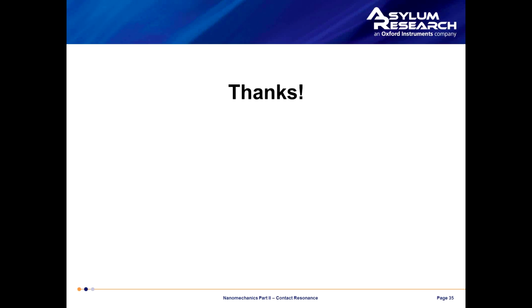All right, thank you. And next, a question for Donna. So back to contact resonance. The question is, this is all carried out in the linear regime, but how does one account for tip damage? I believe this should affect the modulus measurement too. Yes, that's right. This is actually related to the earlier question I answered. Our signal does depend on the tip-sample contact area. So especially when we're working with very stiff materials like metals or ceramics or very hard materials, the tip will wear, and we have to be aware of that. Your signal might be gradually changing, and this is a reason for using the calibration approach.